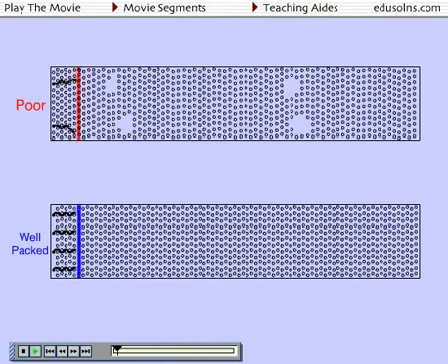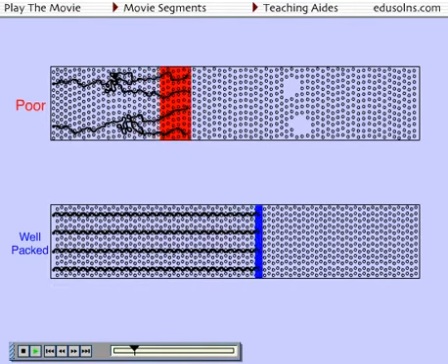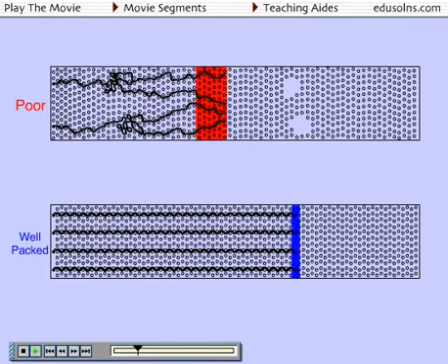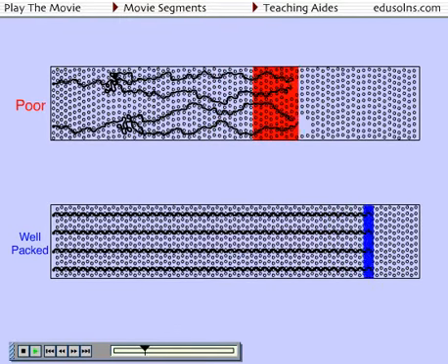There are a number of factors affecting the resolution of a chromatography system. The most simple to understand is the nature of the packing in a column. Two column packings are illustrated here. The top column is a poorly packed column due to the relatively large void spaces between the solid support. The column on the bottom is adequately packed. Note the flow patterns through the columns.